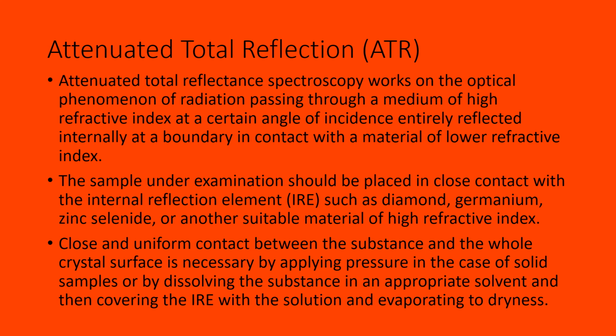A small amount of sample is placed in close contact with the IRE with a high refractive index. This is very useful to take a scan of polyethylene bags to check for compliance to EP 3.1.3 or USP 661.1.